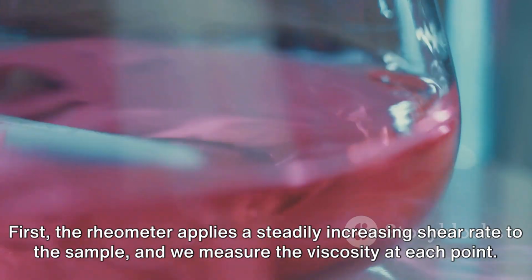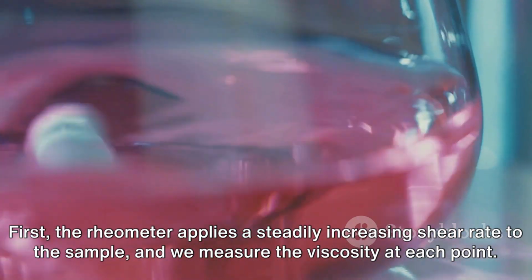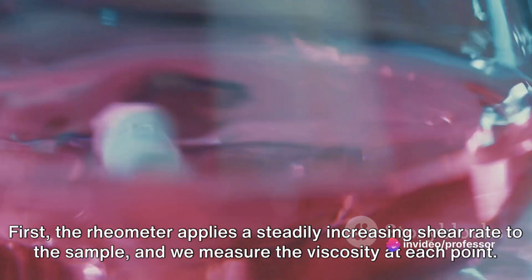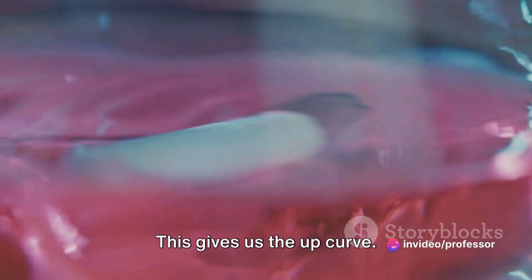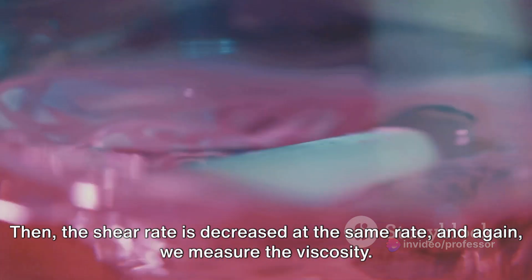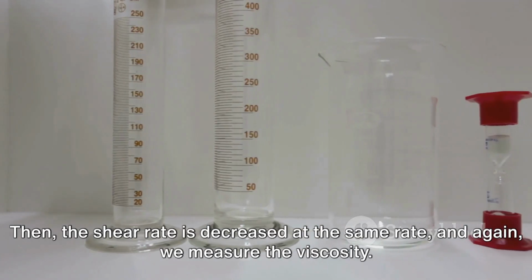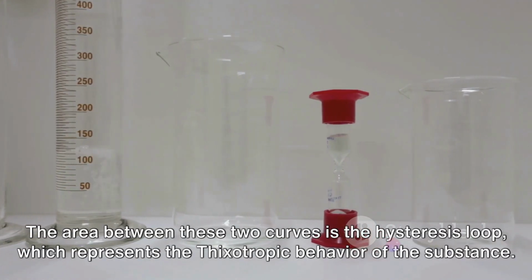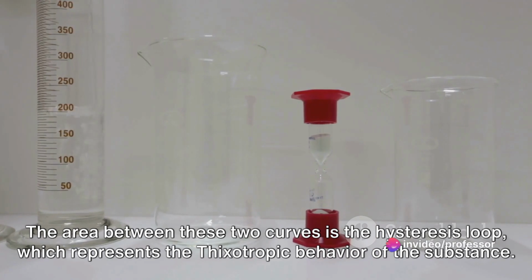Here's how it works. First, the rheometer applies a steadily increasing shear rate to the sample, and we measure the viscosity at each point. This gives us the up curve. Then, the shear rate is decreased at the same rate, and again, we measure the viscosity. This gives us the down curve. The area between these two curves is the hysteresis loop, which represents the thixotropic behavior of the substance.